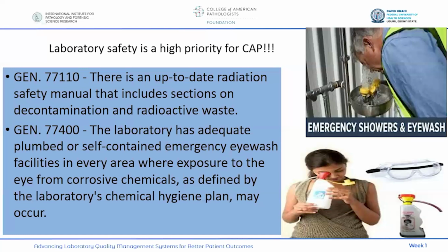77400 requires that the lab has adequate plumbed or self-contained emergency eye wash facilities in every area where exposure to the eye may occur. Eye wash facilities. So if you look at the right part, you will see the emergency eye wash. Typically, you can see somebody bending down to have water splash into his eyes. So typically, the water from the eye wash jets upwards, as opposed to what you have in your regular taps. Okay, so with the eye wash, the water jets upwards.